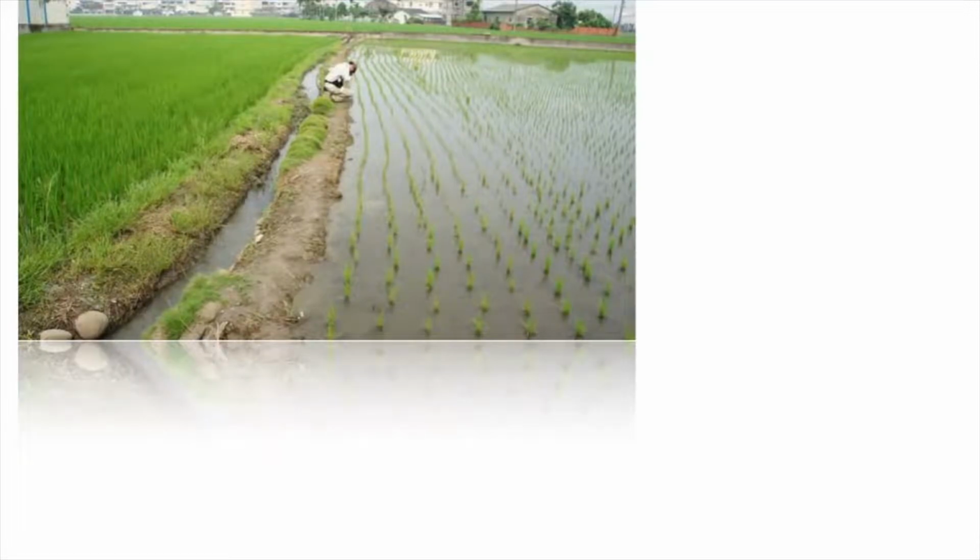We are going to introduce our method to establish a strain of algae, especially unicellular conjugatophytes. For the establishment of a strain, collection of a water sample which contains algae through fieldwork is necessary.